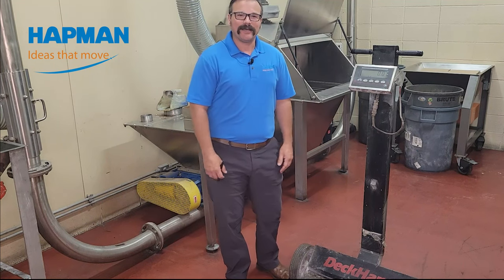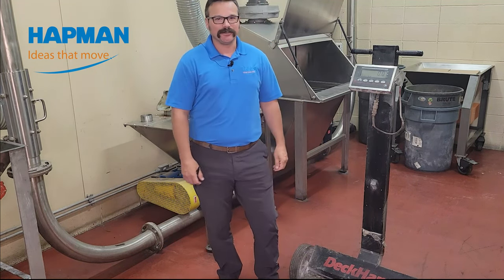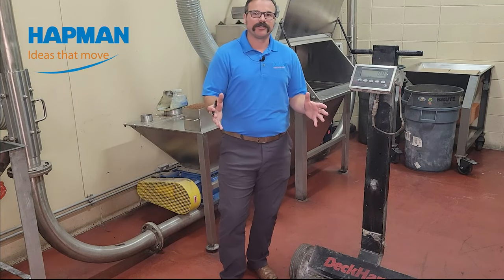Hi, welcome to Hapman. I'm Rob DeHaan. We're standing here in our material test lab where we test all kinds of materials. One of the most important questions that we're going to ask you is: what is your material's bulk density?